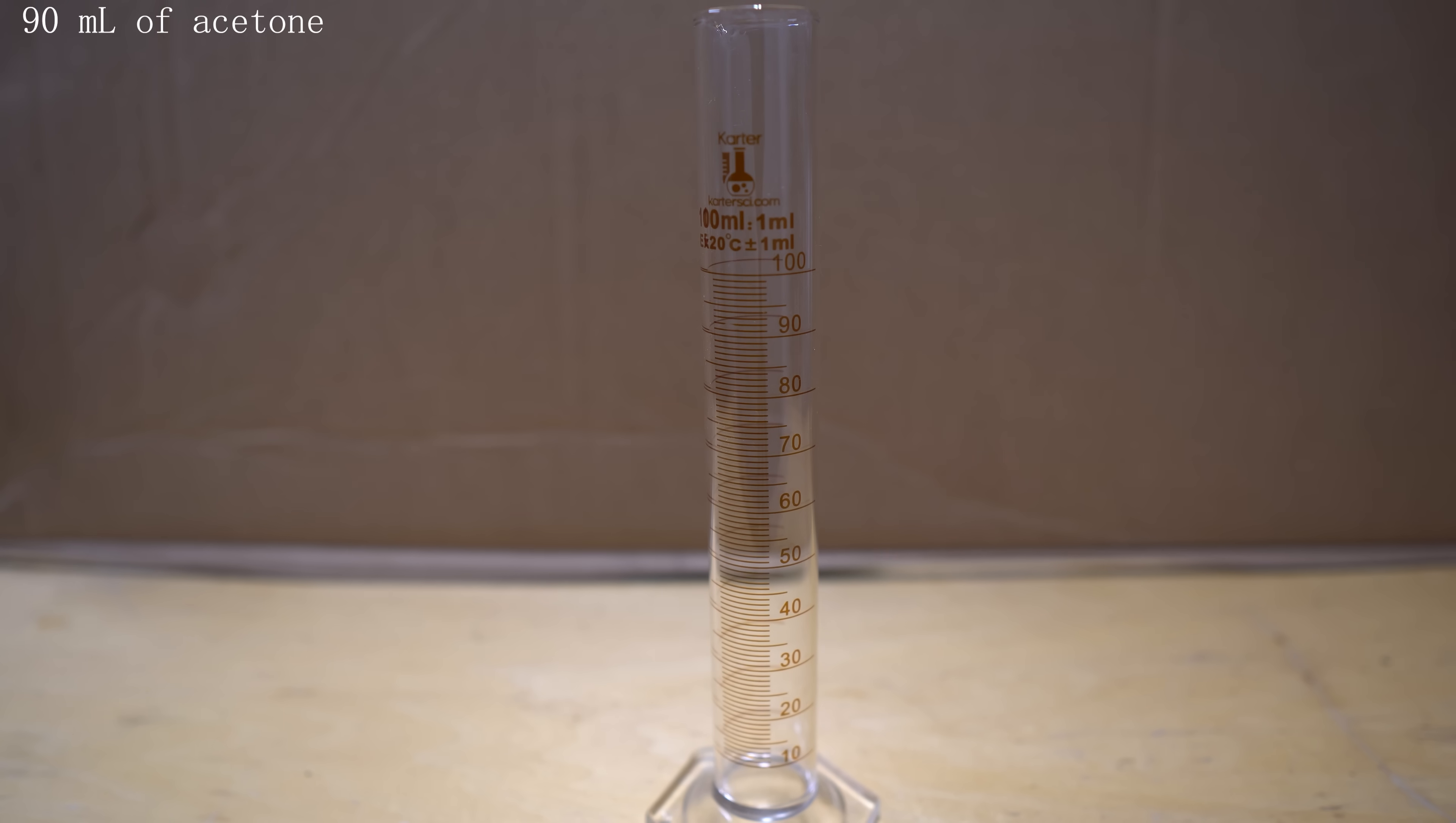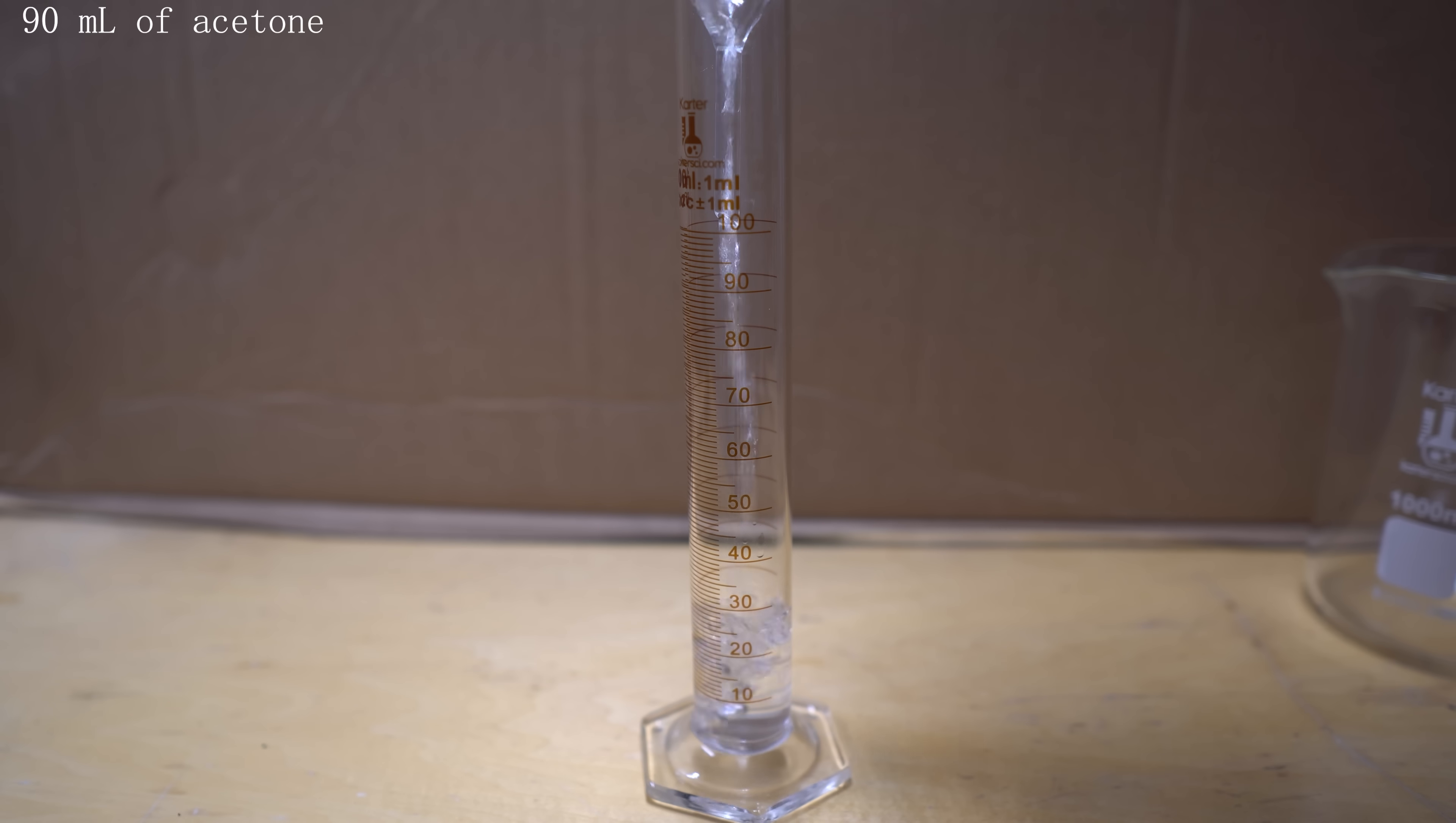You're going to want an excess of the sodium hypochlorite, so I'm using about 90ml of acetone for the 3.57L of bleach. A lot of people will make calculations on how much to use. I'm not Nile Red, so I'm not going to do that.